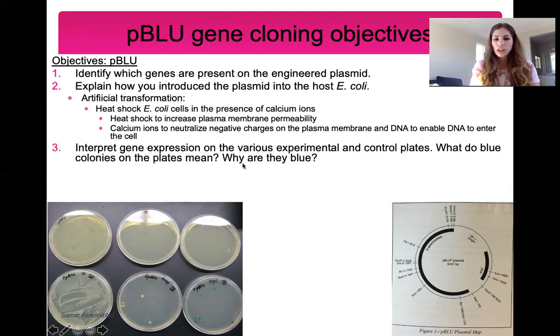And then interpret gene expression on the plates. So when you look at plates, what do blue colonies mean? What do white colonies mean? What does it mean that just E. coli, why did E. coli not grow on the agar plate with ampicillin? It doesn't because it's not resistant to ampicillin.